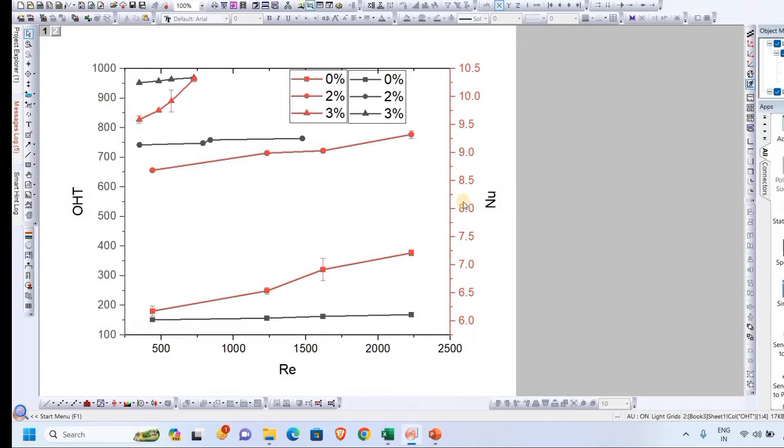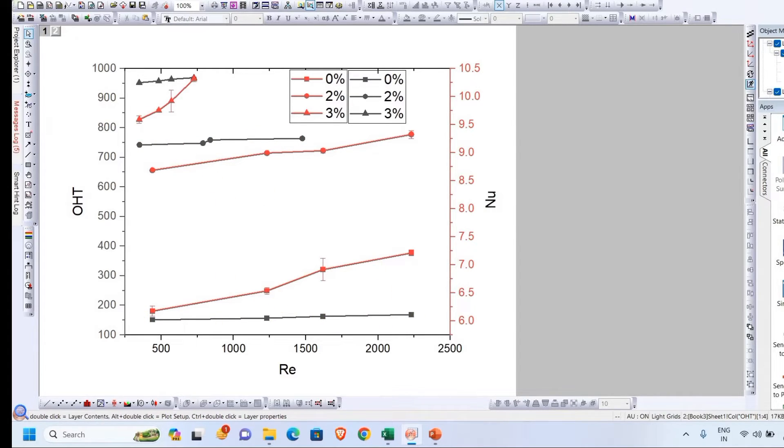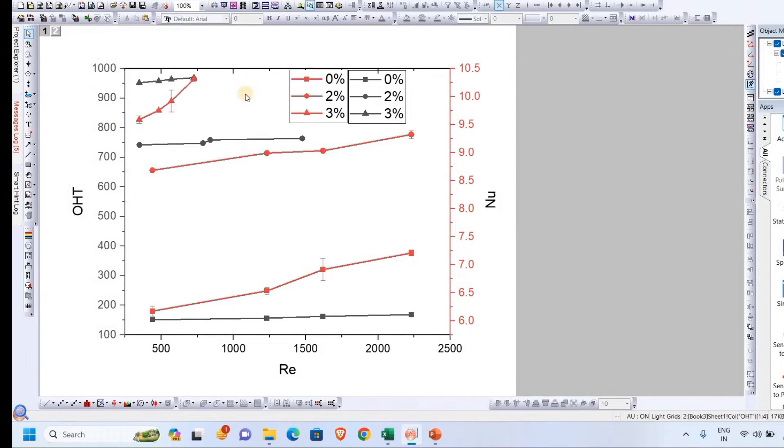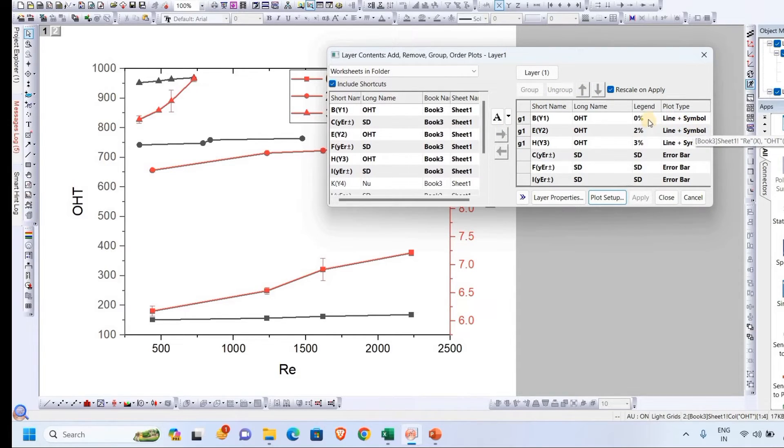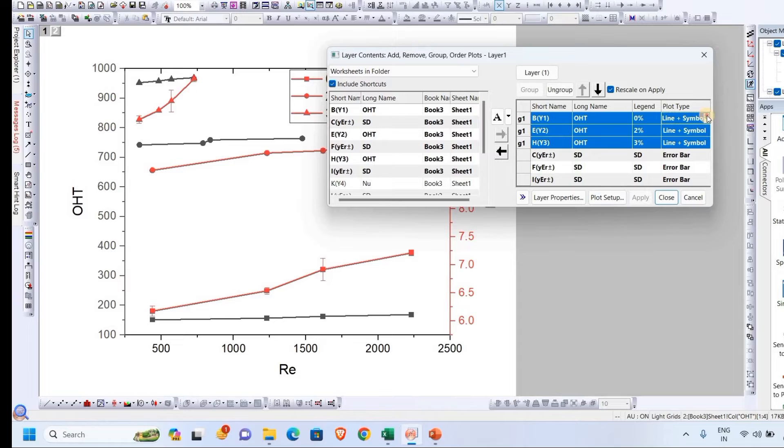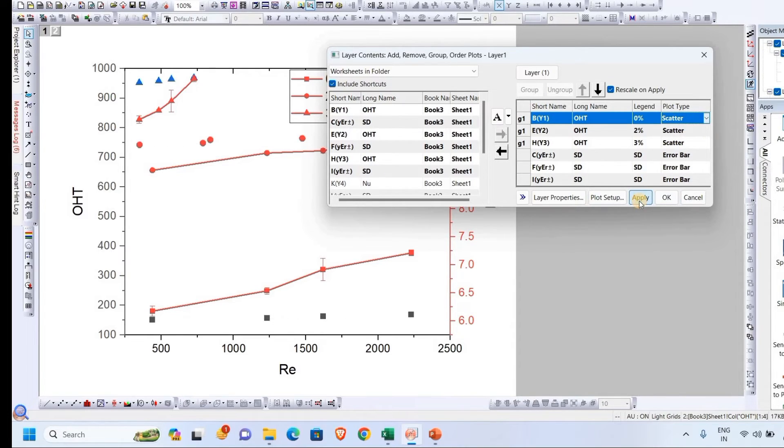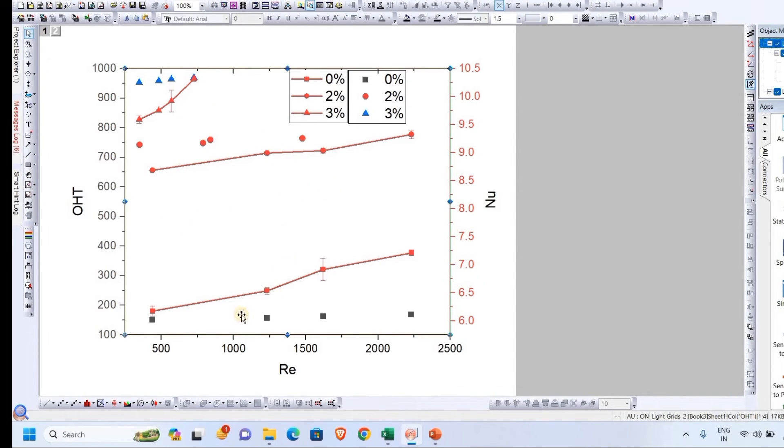One more thing I will tell you here: we want a scatter plot for the primary axis, that is y1, and we will keep it as a line and symbol graph for the secondary axis. That means all these black lines will disappear and only the dots will be there. So we can do that as well. Go to layer content, and in layer 1, we don't want this. We simply want to change to the scatter one.